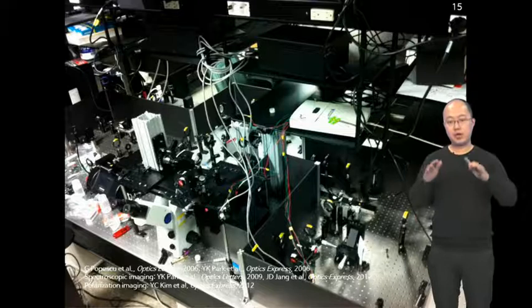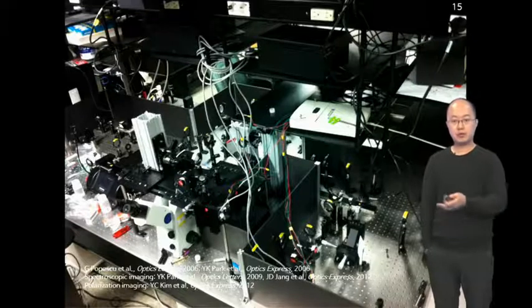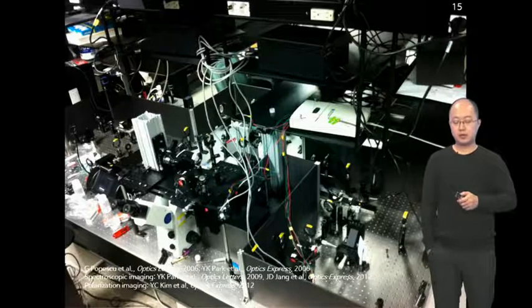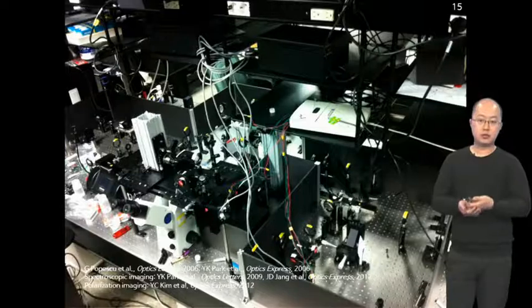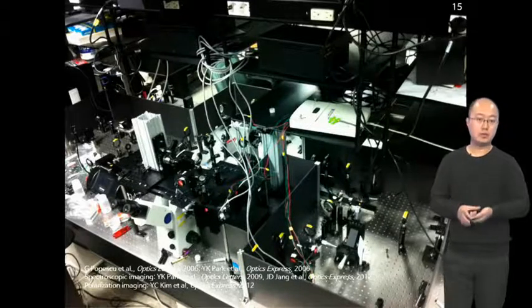Even though you have built up the system and it is working fine, after some time, or for example once your lab mate hits the table, you need to spend a few hours at least to fine tune this system. So we realized this is not a good way to spread this nice technique to the real world, to those who are interested in using this system for biological study or medical applications.